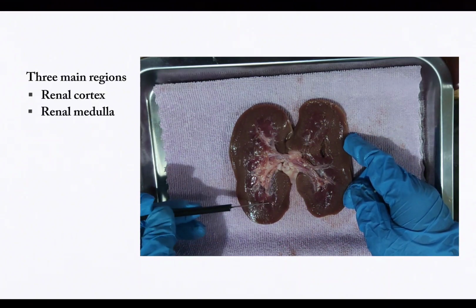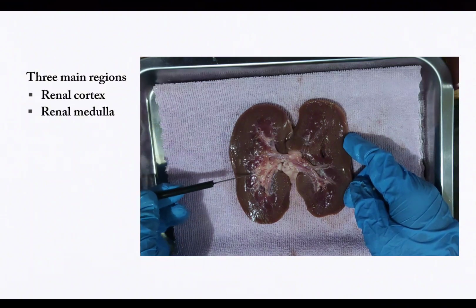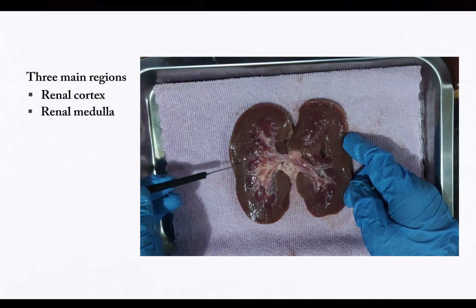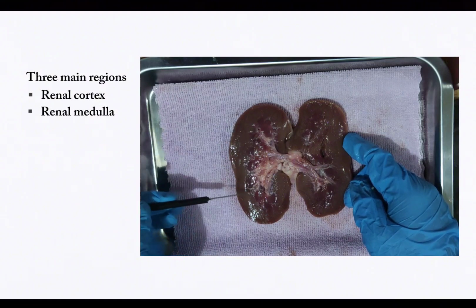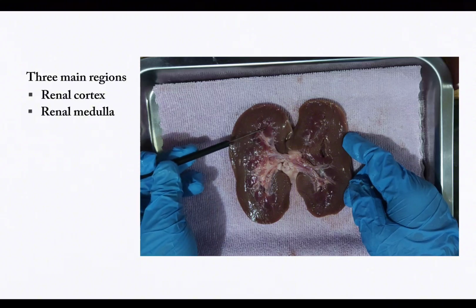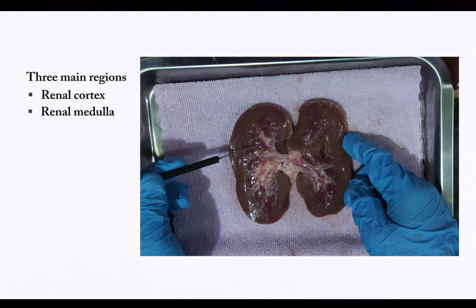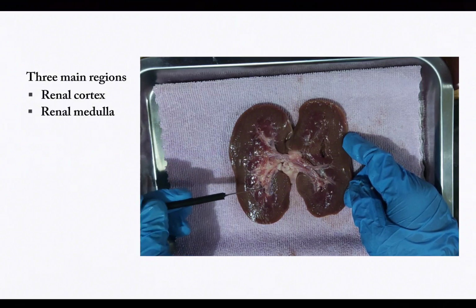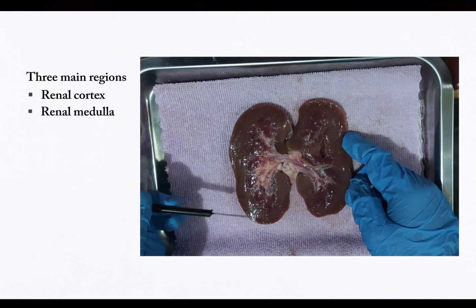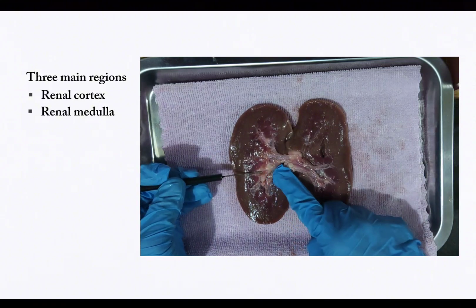Second, the renal medulla houses the nephron loop, commonly known as the loop of Henle, and is where absorption occurs. We can also see the renal pyramids, which collect and carry the produced urine from the nephron's renal tubules. There are also several renal pyramids visible, which are divided by renal columns. We can also see medium-sized veins in the renal columns that transport blood filtered by the nephrons to the renal cortex. The white component is known as the calyces, and it is divided into two separate parts.